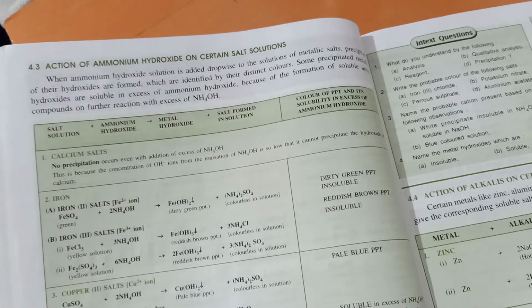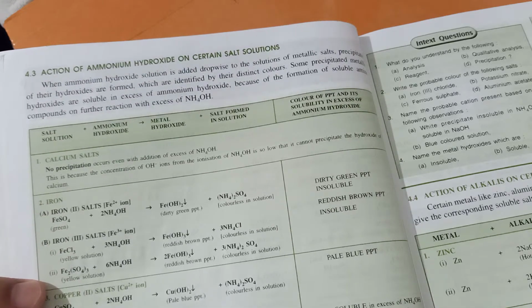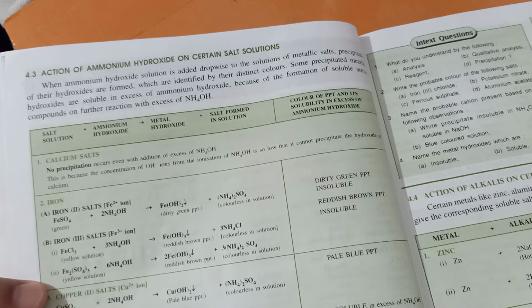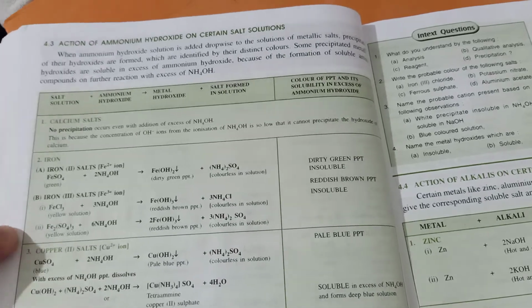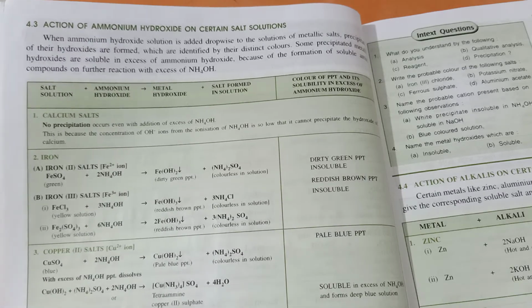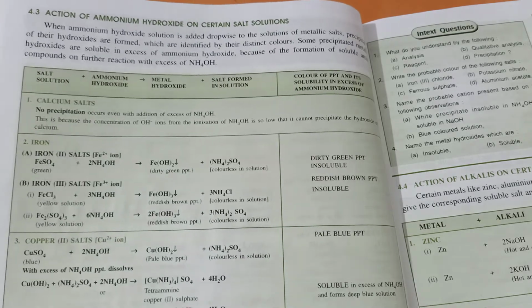Now we have to understand that ammonium hydroxide is a weak base. Therefore, it produces a lesser number of hydroxide ions. Now this lesser number of hydroxide ions produced by ammonium hydroxide causes some changes in the way these different metallic salts form precipitates and their further action on excess amount of ammonium hydroxide solution.